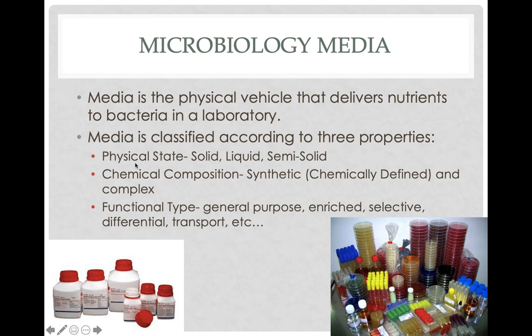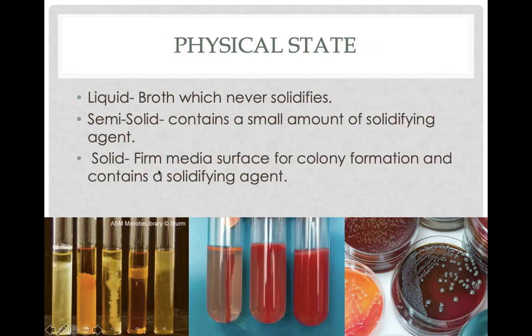And this makes sense if you think about it. So physical state is really easy. It's liquid, broth, or solid, or semi-solid, excuse me. Liquid makes perfect sense. If it's essentially just chicken broth or beef broth or something like that, it's a liquid media. It never turns solid. No matter how long it sits there, it will always be liquid. So this allows you to keep bacteria that can swim around, or you can tell how they like oxygen, which we'll talk about later.